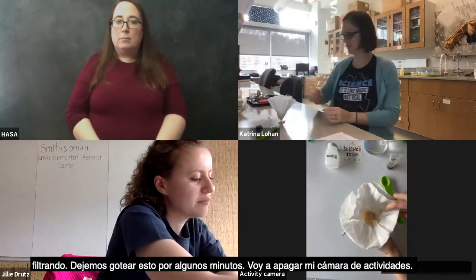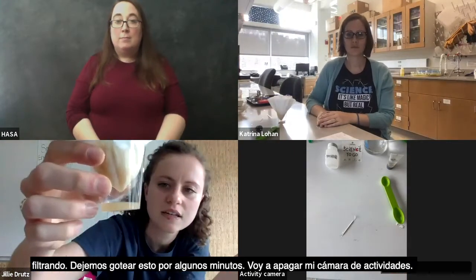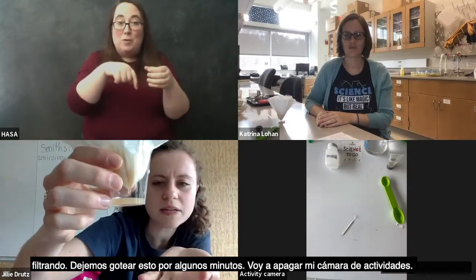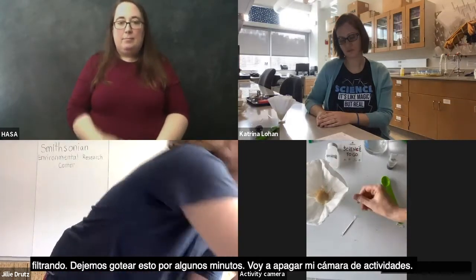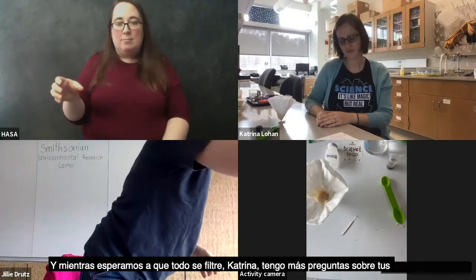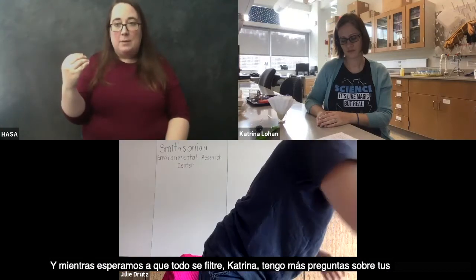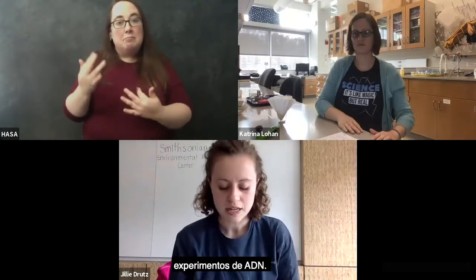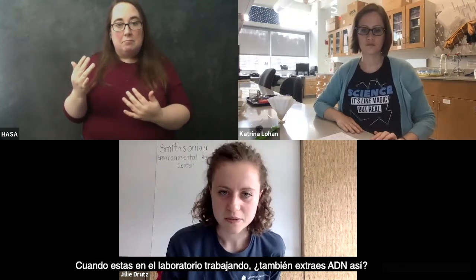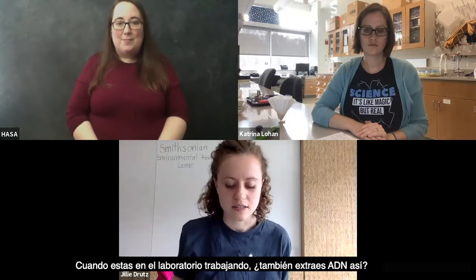I'm going to bring mine to my other camera so you can also see it dripping. We want to give this a few minutes, so let's put that aside. I'm going to turn that separate camera off. And while we're waiting for that to finish filtering through, Katrina, I've got some more questions for you about how you study DNA.